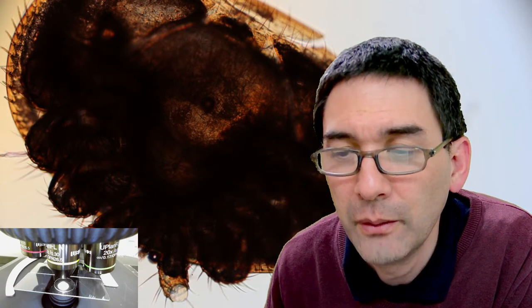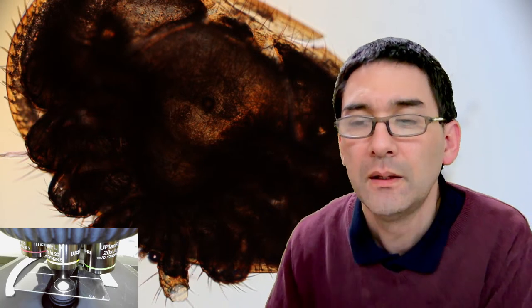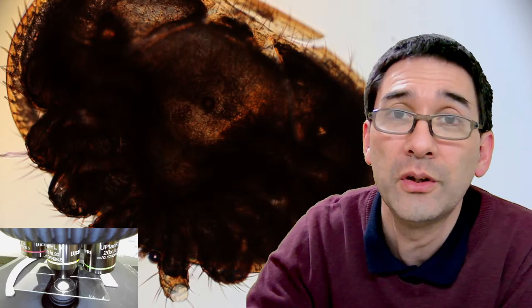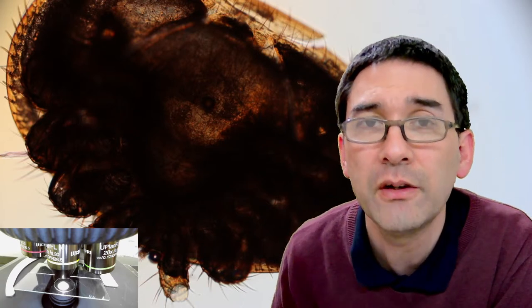Which phone is the best to film through the eyepiece? I wouldn't be able to say that, because I would say it's not the mobile phone that is the limiting factor. It depends more on the eyepiece, such as the field of view of the eyepiece. If the mobile phone is able to make a very good video or pictures without a microscope, then why should it not make a good one if properly set up with a microscope? So I think the mobile phone itself is really not the issue. Modern mobile phones have a very high resolution anyway, and there is plenty of light available over the microscope.